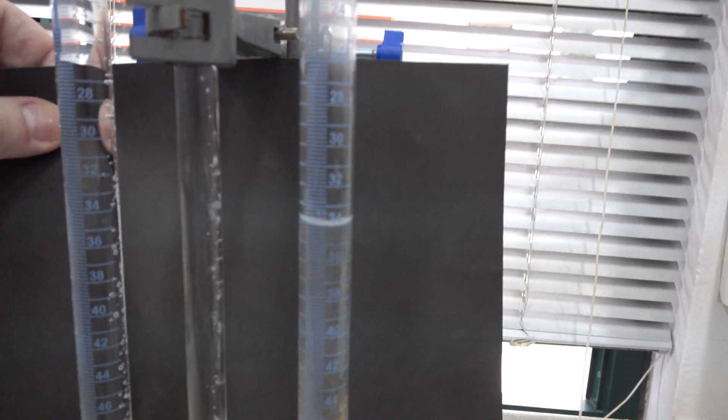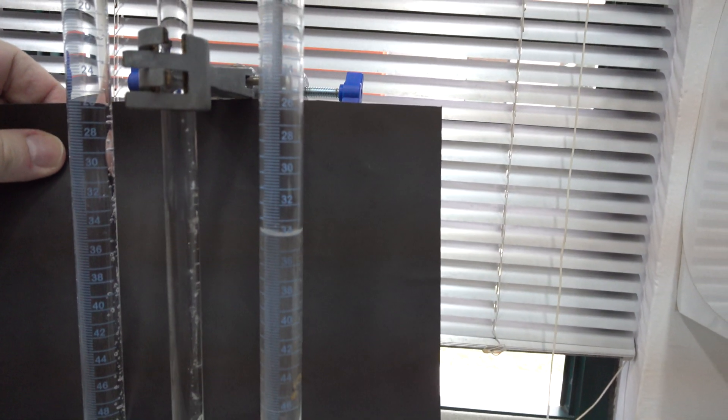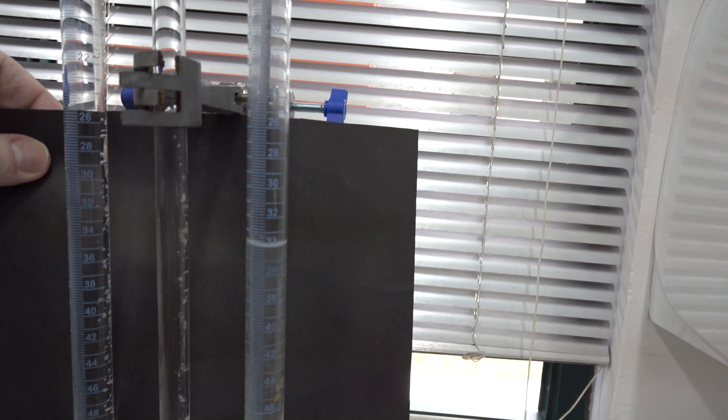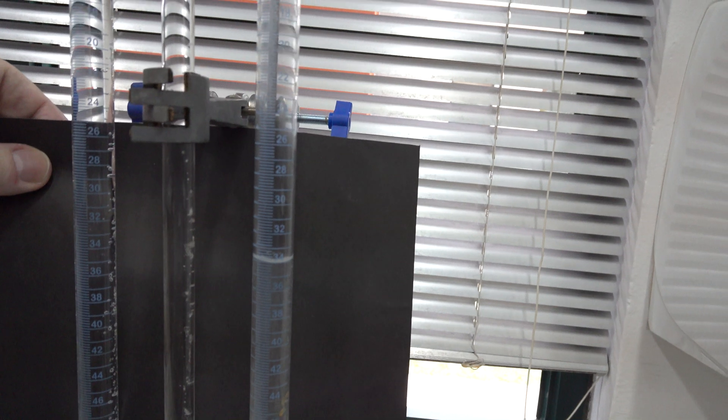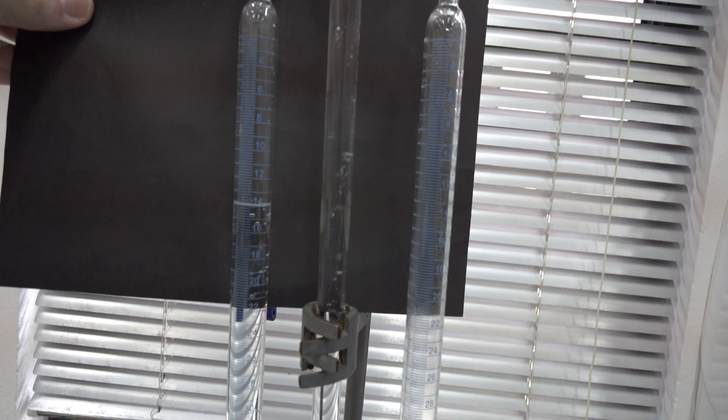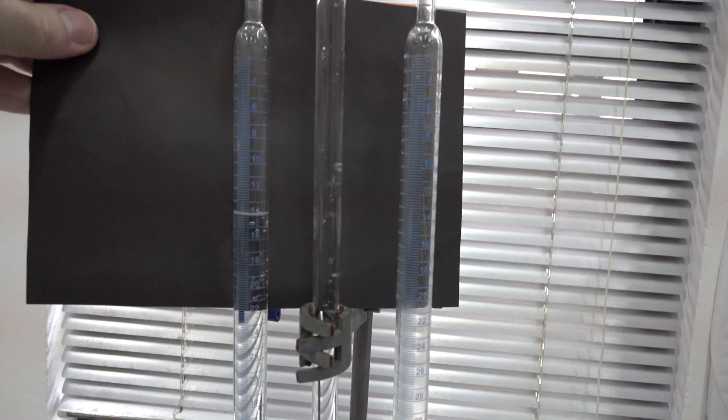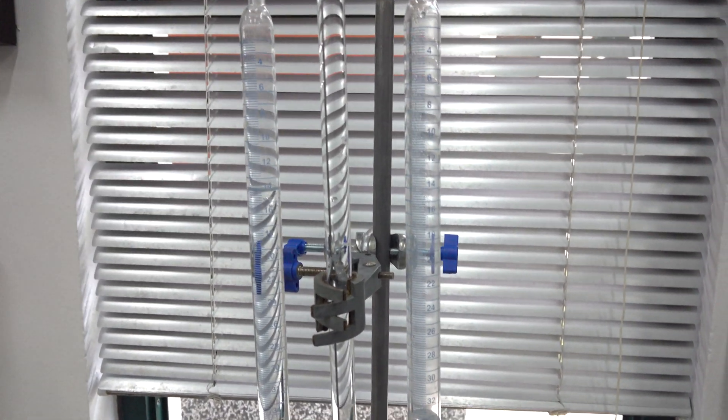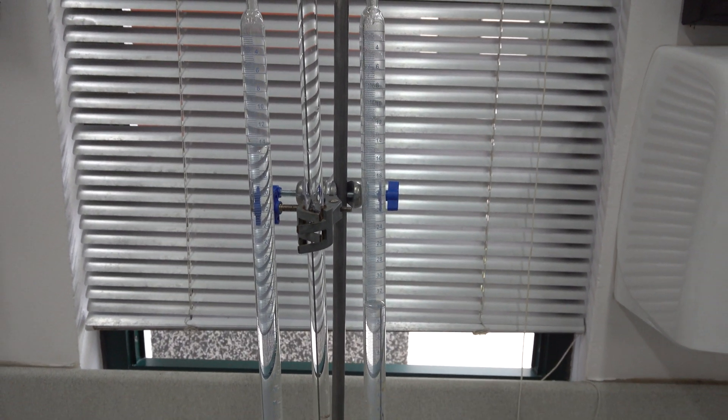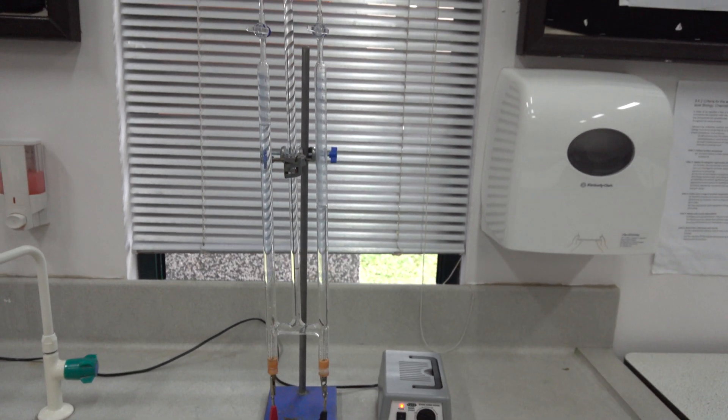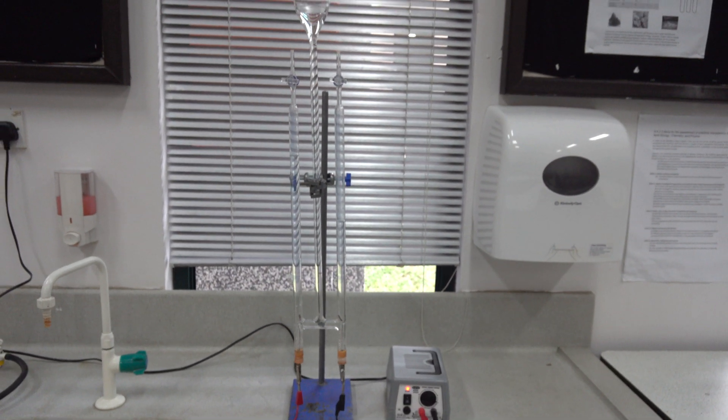If we look at the volume of gas that's been collected, again with the black card, you can see we've got about 33 to 34 cubic centimeters of gas above the cathode, whilst we've got about 14 cubic centimeters of gas above the anode. Let's pause the camera, collect the gases, and see what results we get.